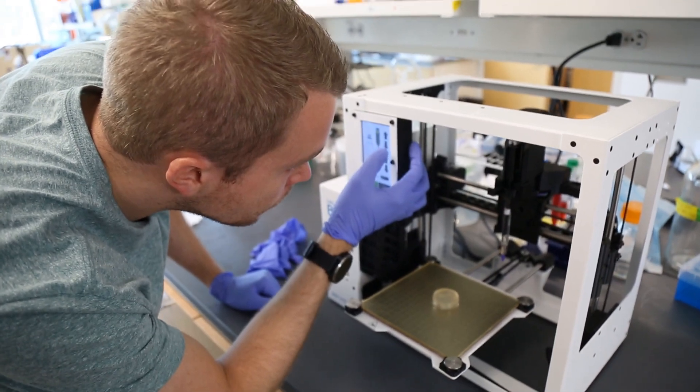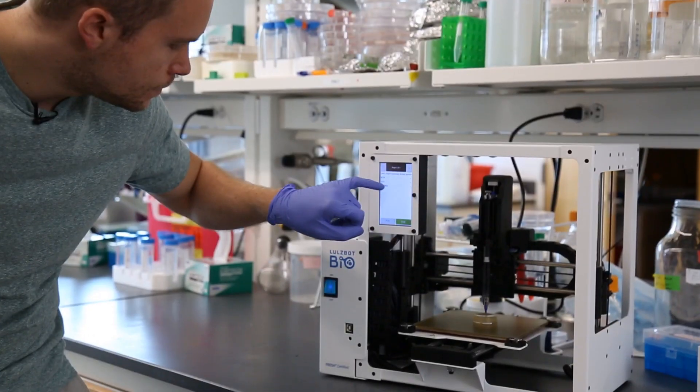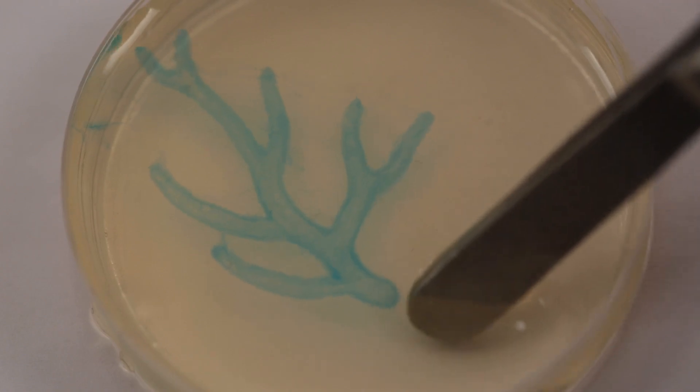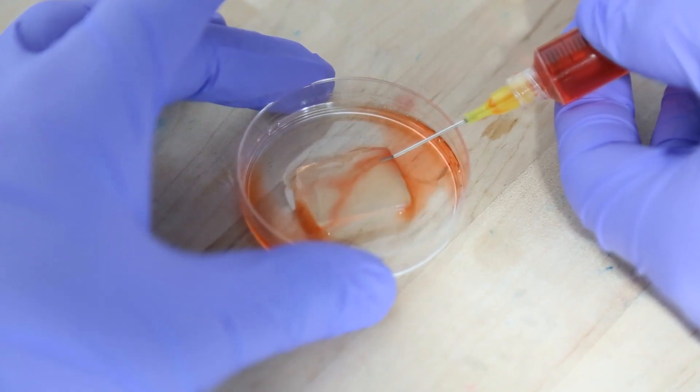We can just print collagen and other materials directly which enables people to start going to the next level of bioprinting where we're starting to make functional tissues. Things like artery trees, we can 3D print these basic tube networks that can help keep cells alive.